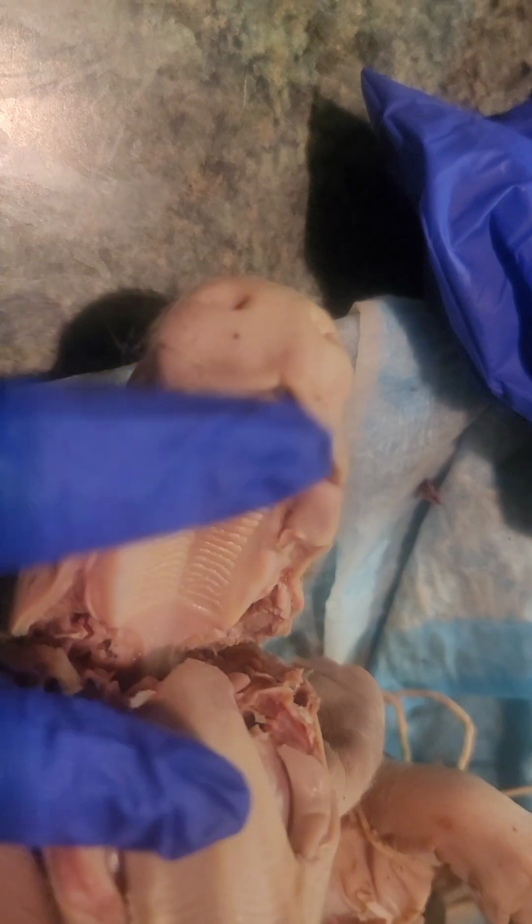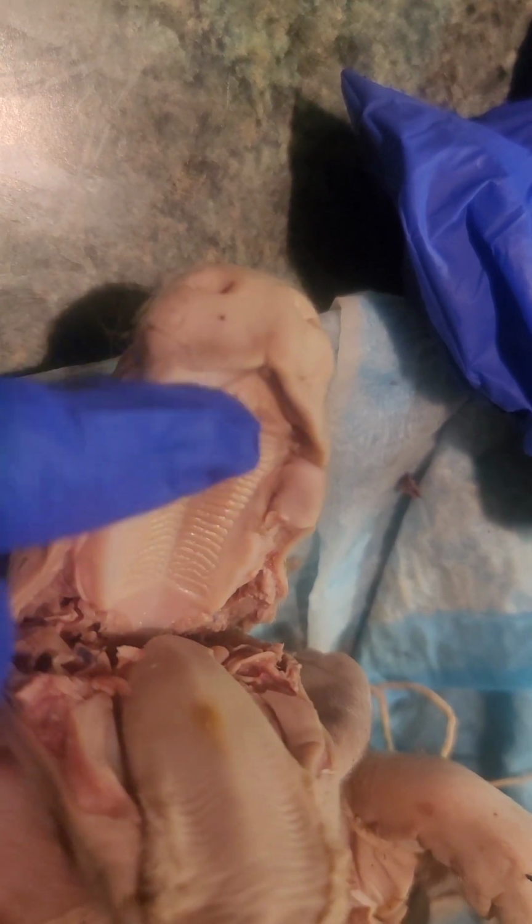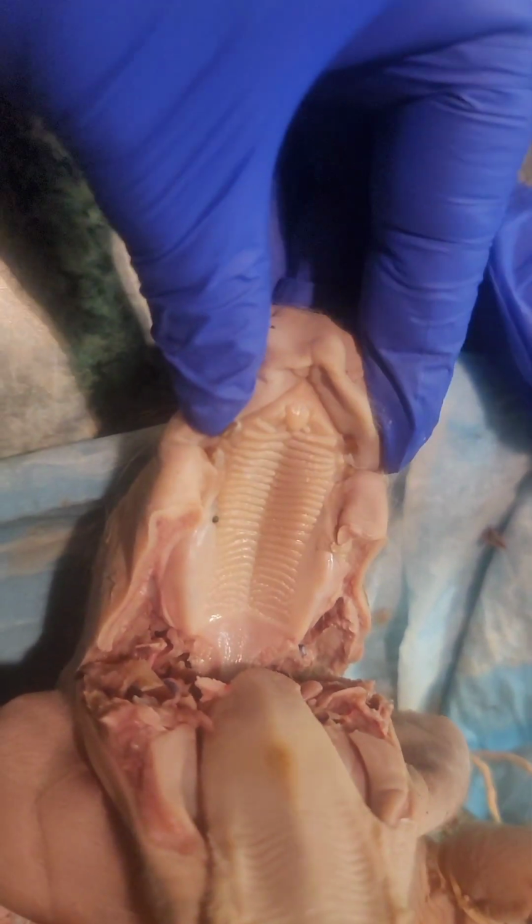Here's my piggy. Flip you around. Okay, so we have the oral cavity, which contains the tongue, the hard palate, which is this ribbed structure, and then the softer spot here is the soft palate. And we have some very sharp teeth. There's some uppers on both sides. There's also some on the bottom.